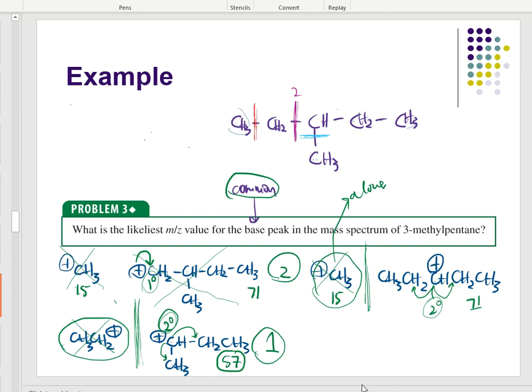Because statistics are going to tell me positive will go here, but sometimes positives will go there too. And the molecule is very reluctant to put those positive charges on those smaller pieces. And because of that, this scenario is going to be a much better case for the molecule. It gives a secondary carbocation which brings stability.